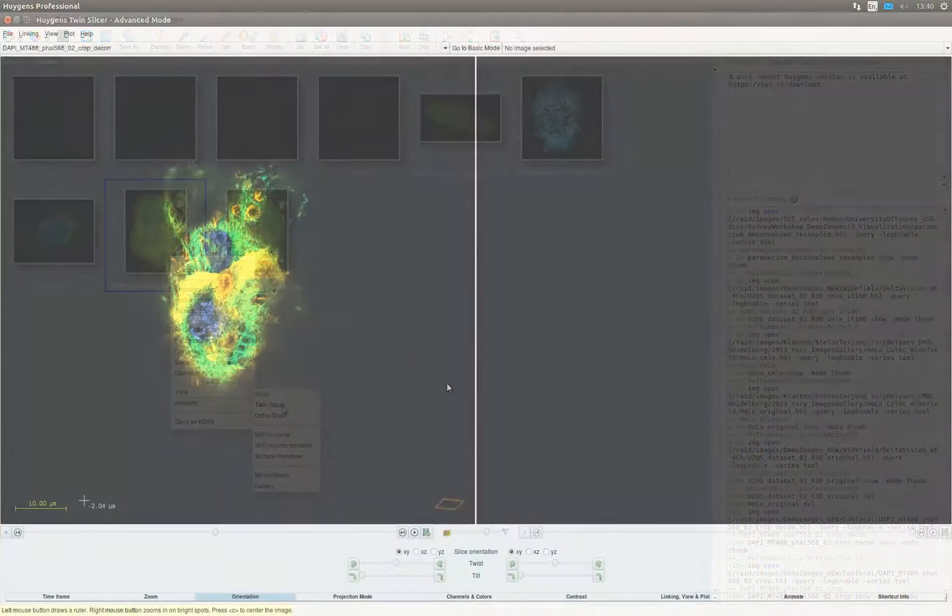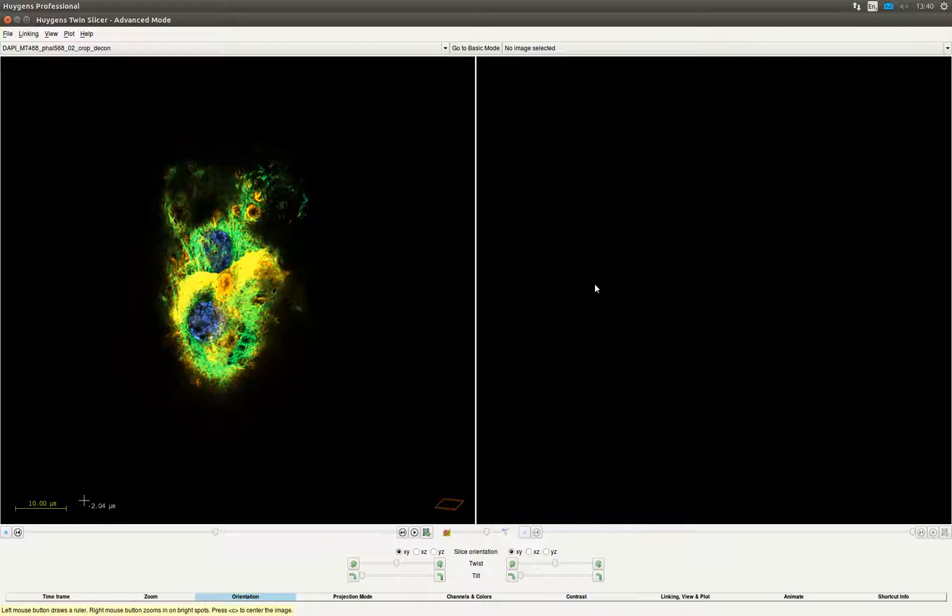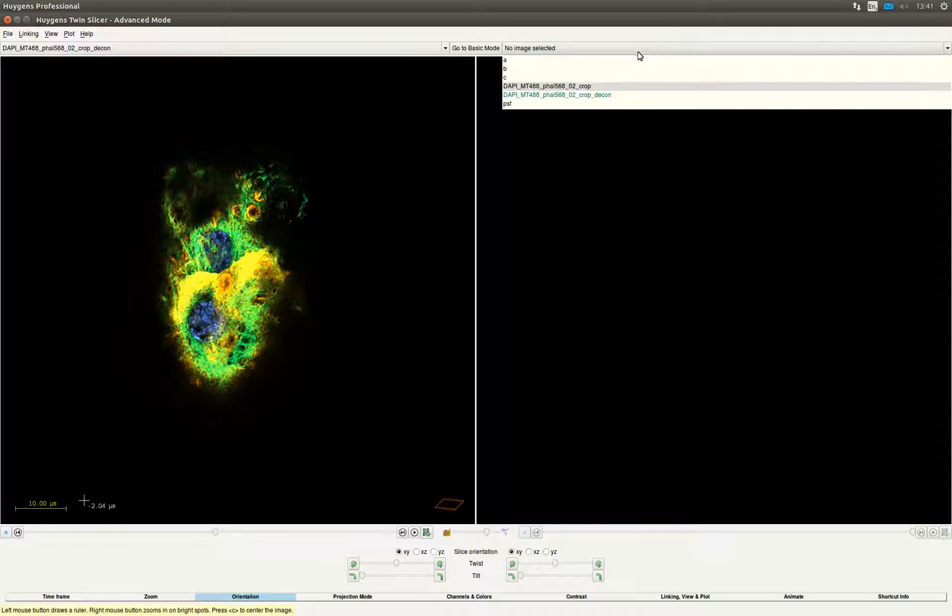The TwinSlicer window will pop up with the selected images displayed on the left side. We are going to open an image on the right side as well so we can compare the images. We select the same image only non-deconvolved, so we can compare the deconvolution results.